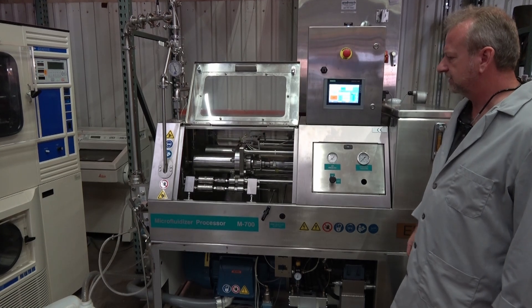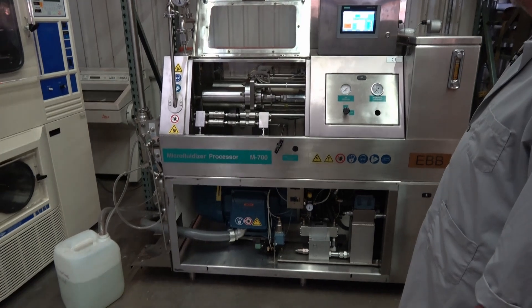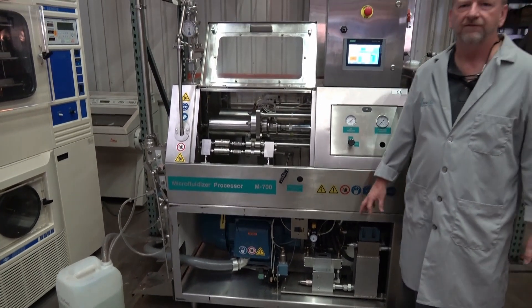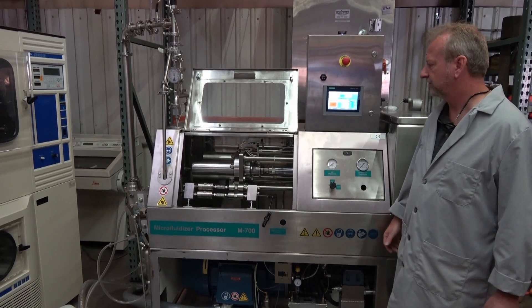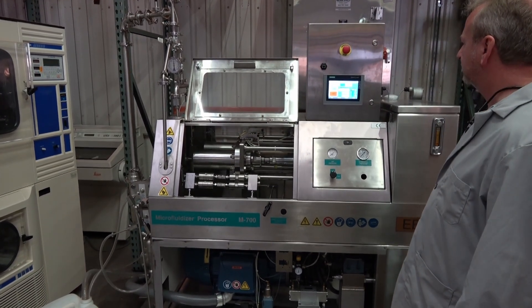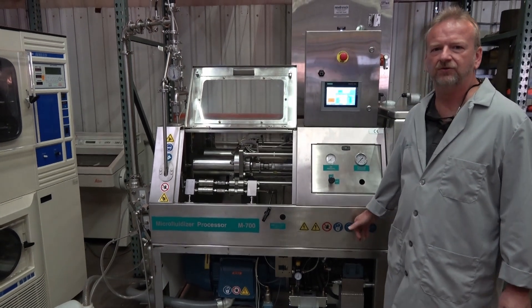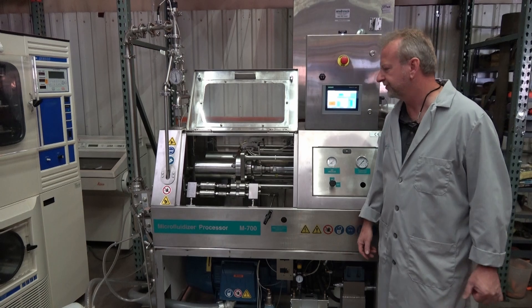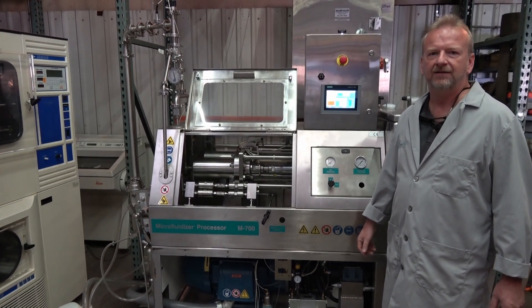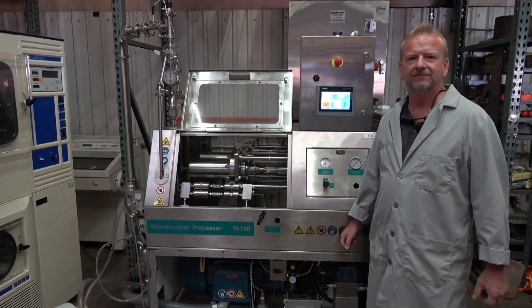As you can see, it runs great. We're getting ready to break it down and move it to our photo area to get more photos in a better atmosphere. That's about it for the operational demo of this machine. If you have any questions about this unit or others like it, we do have other models — including a 30k single cylinder machine available right now. Give us a call here at New Life Scientific. Thank you.